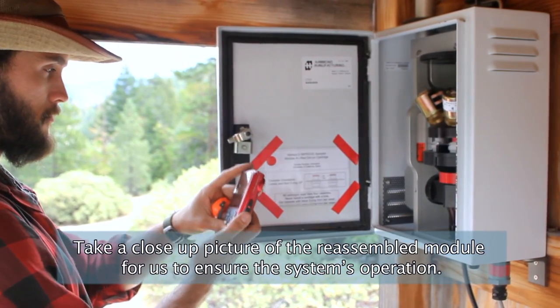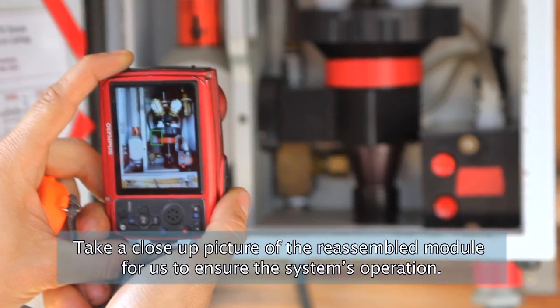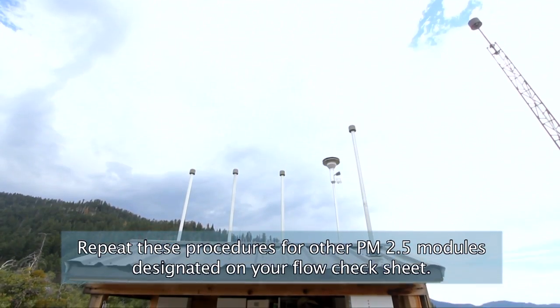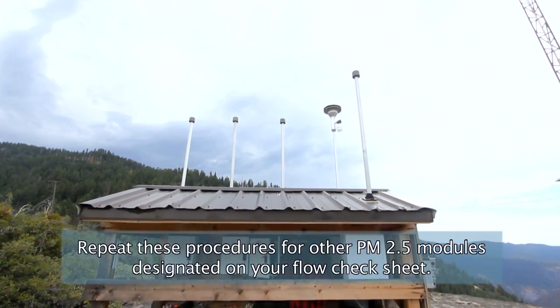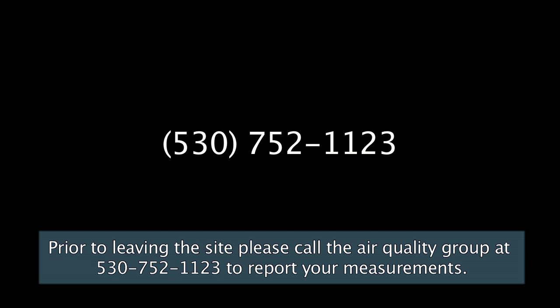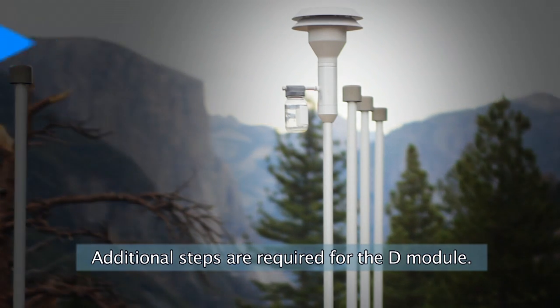Finally, take a close-up picture of the reassembled module for us to ensure the system's operation. Repeat these procedures for other PM 2.5 modules designated on your flow check sheet. Prior to leaving the site, please call the air quality group at 530-752-1123 to report your measurements. Additional steps are required for the D module.